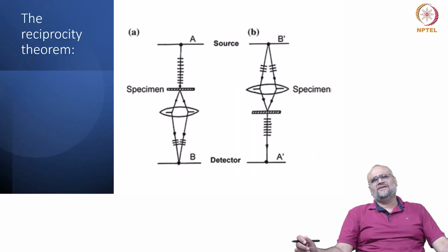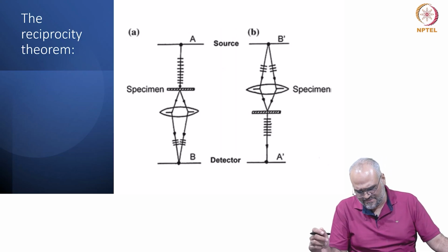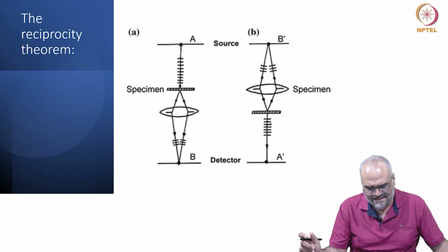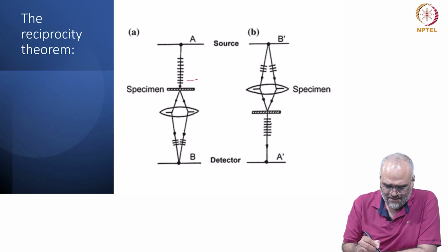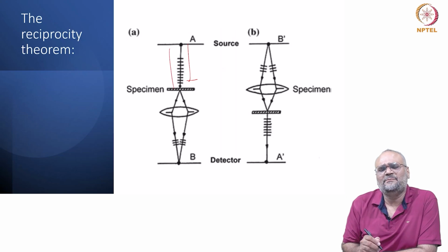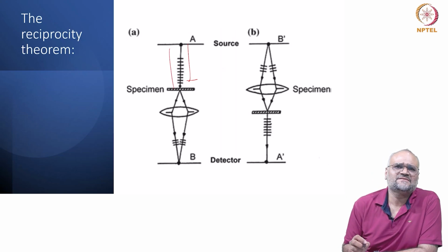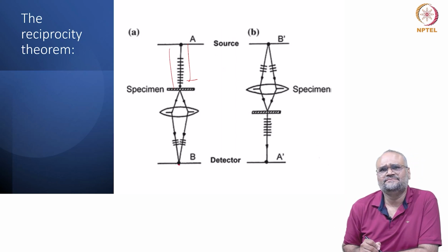So if I look at how the specimen is illuminated in TEM mode versus STEM mode, in figure A that is shown here, I have taken this from the textbook from Tanaka. You can see that the specimen, when illuminated with a parallel beam, has a parallel kind of electron beam going through the specimen, and the exit wave now appears like a spot pattern at the back focal plane, and from these spots through an interference pattern you are constructing an image on the detector.